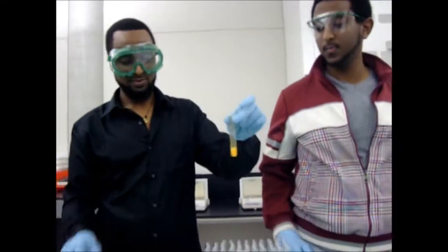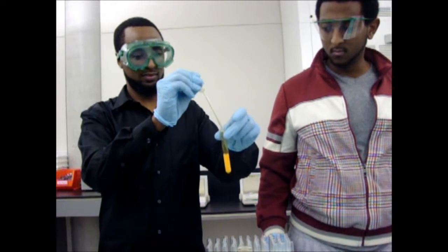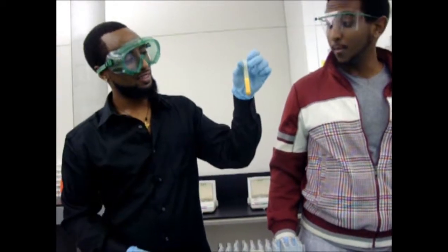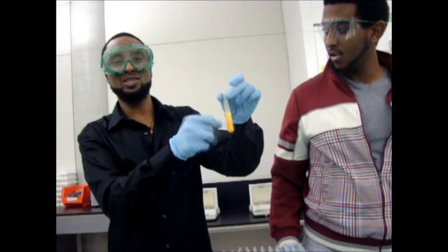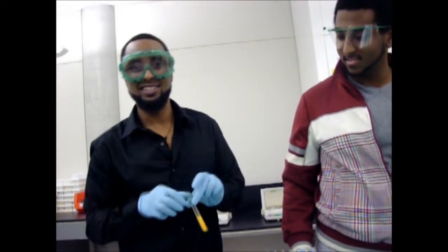So we have a negative test because it did not turn clear, which is quite surprising considering lidocaine does have an alkene. But we do further tests.